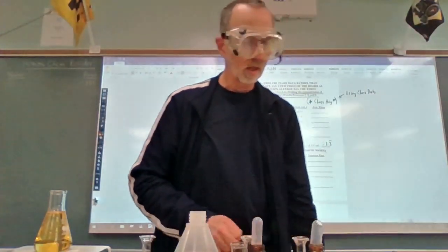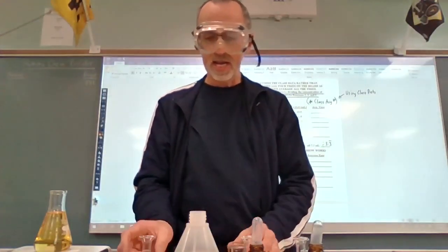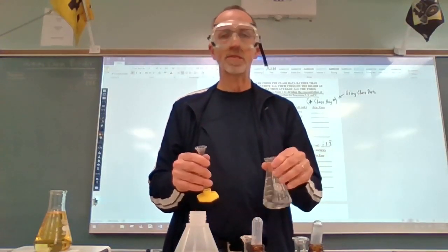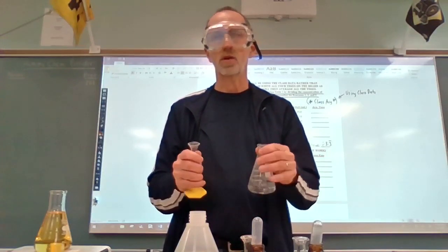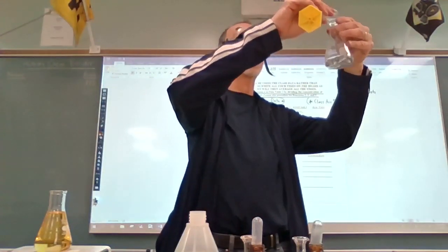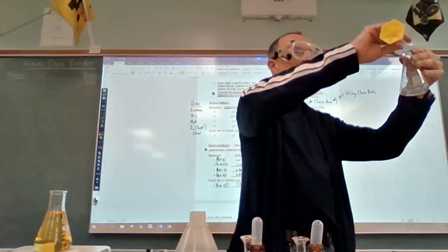All right, so when I add the iodine, the clock will begin, and we'll see how long it takes for the reaction to go to completion. Be nice to have a third hand here, but that's okay.